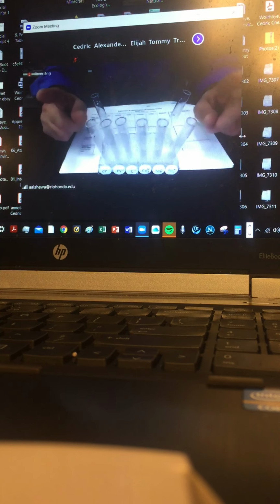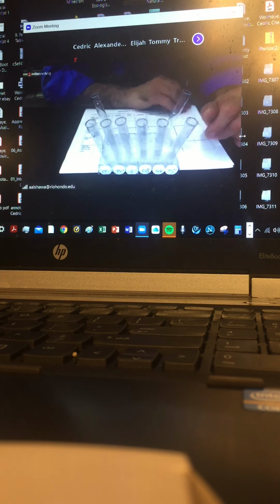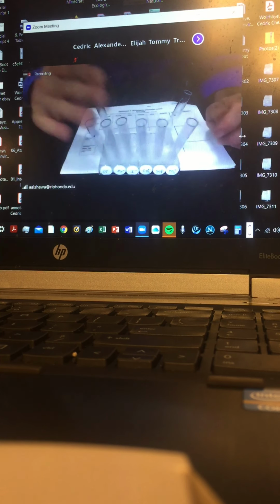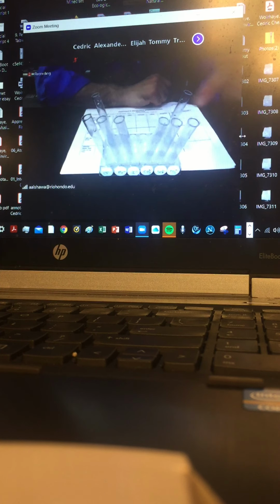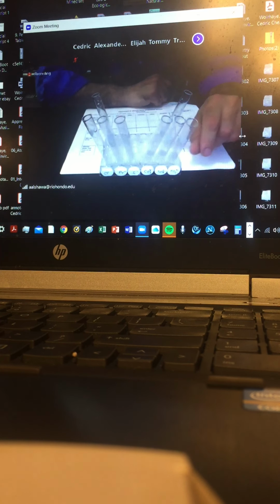Instead of having just one student doing it, otherwise it will take maybe 3 hours by the time you wash them and clean them, making sure they're ready for the second test, because you have 3 separate tests. The first test is to explore the halides, and we did. It is positive for the halide, obviously, which is a solid precipitate. But negative if you have polyatomic ions: carbonate, sulfate, and phosphate. Whatever solid was there is gone, so that's negative for that test.